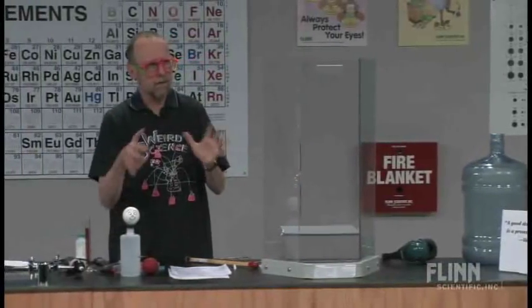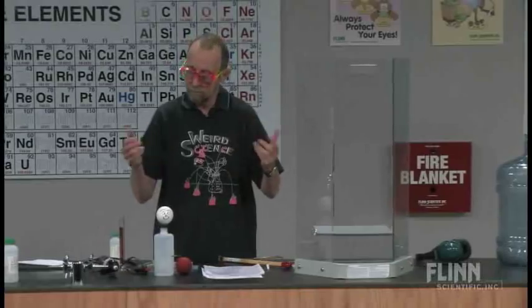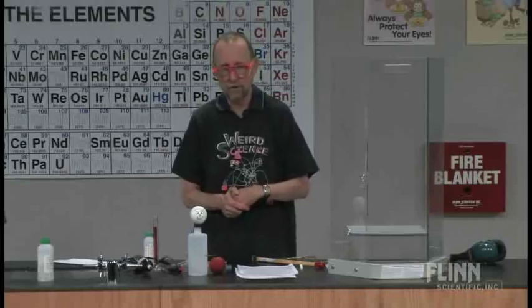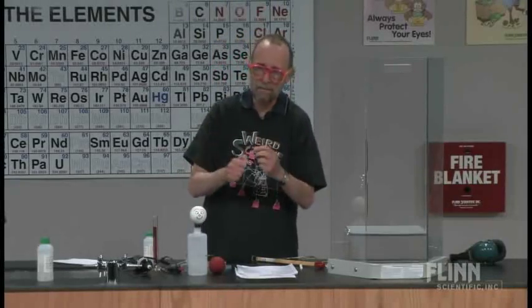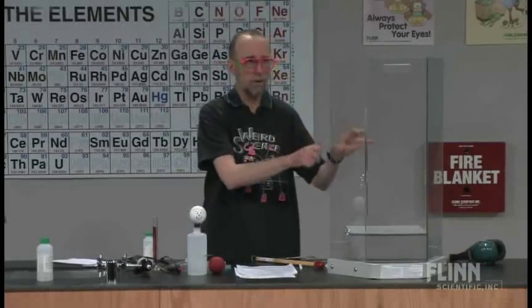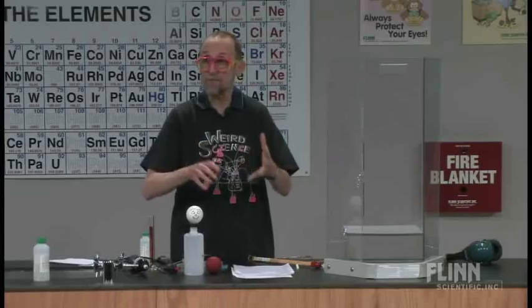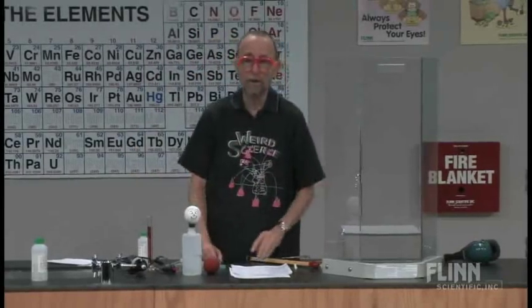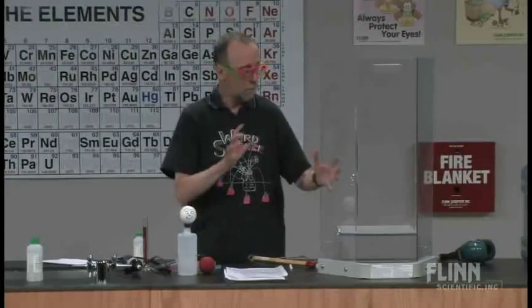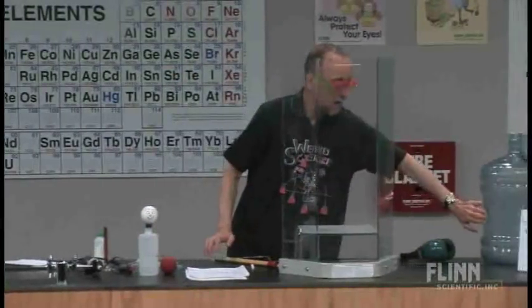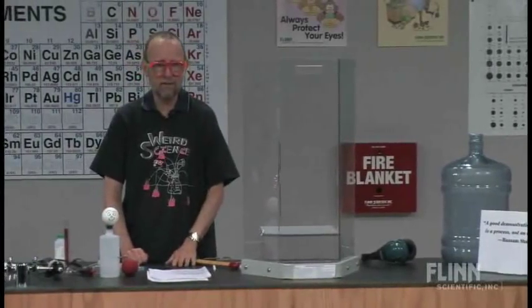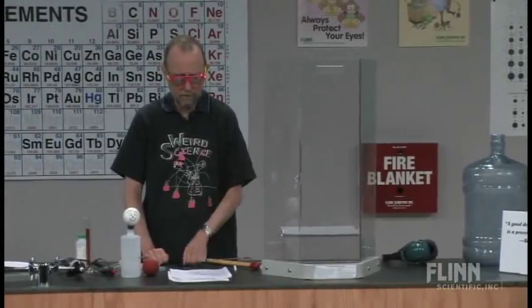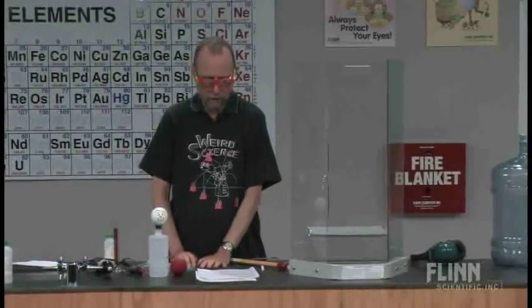Don't use a square bottle. Sometimes the water bottles are square. They will blow up. I was running a workshop. A teacher brought a square one in. I said, let's not do it in that. She said, let's do it in that. I said, okay, we'll do it. We're going to tape it. I'm going to say it might blow up, and so forth. Anyway, to make a long story short, she put it in, and it blew up. It didn't explode. The tape stopped it, but the top came over and got hung up on the tape, and life was good. And she goes, oh, okay. And then sometimes they have handles on them. I don't think I'd even do it with that, because the plastic is stressed in those parts. But I'd use this kind if you can find them. That's what I've always used.